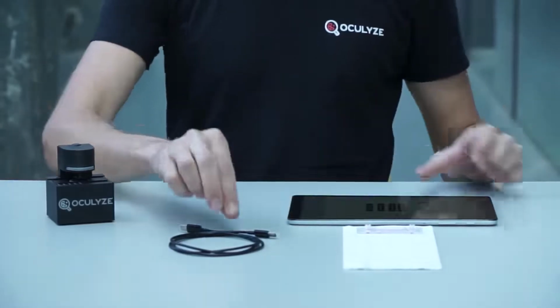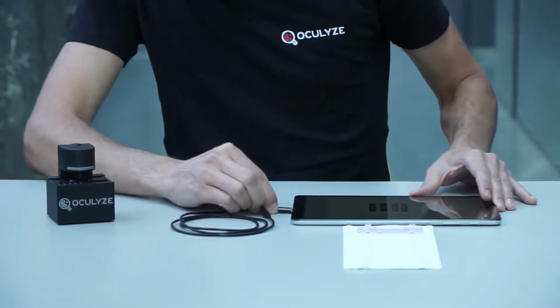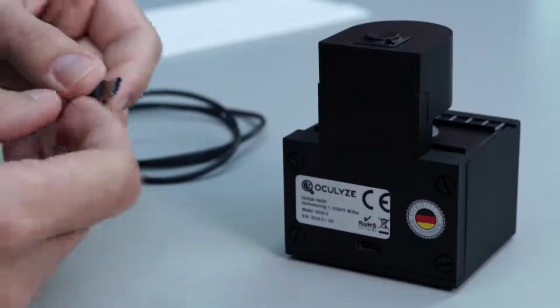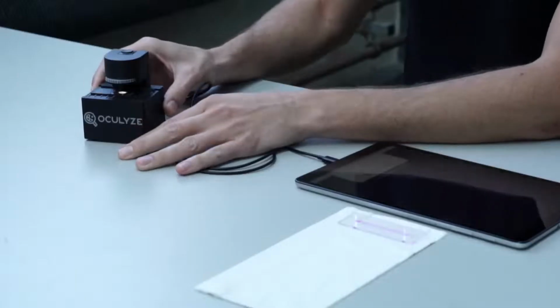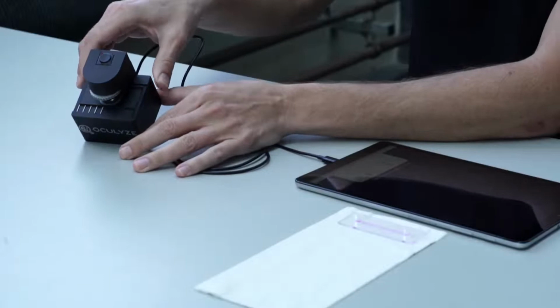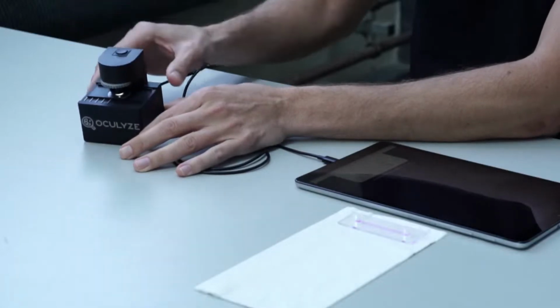Now that the chamber is ready, let's start measuring. Firstly, let's plug our compatible device into the microscope. The microscope is powered by the mobile device, and the red light will illuminate when the two are successfully connected.